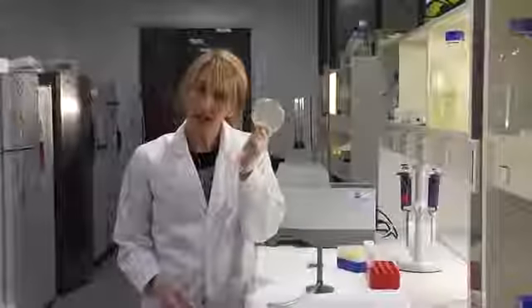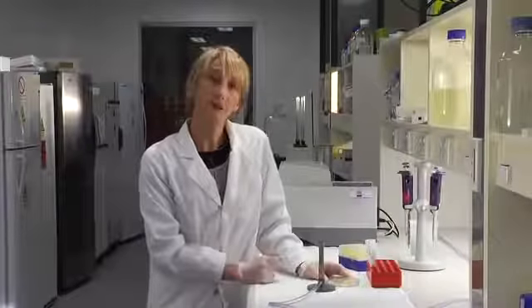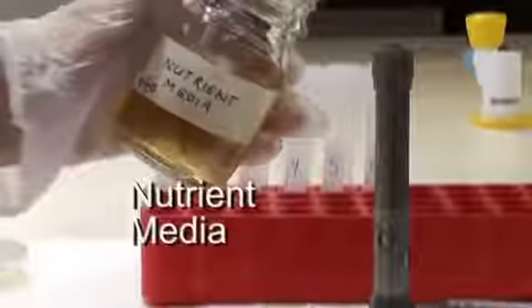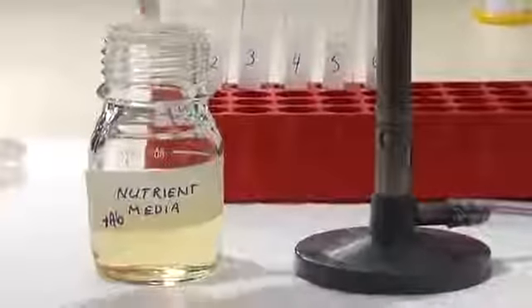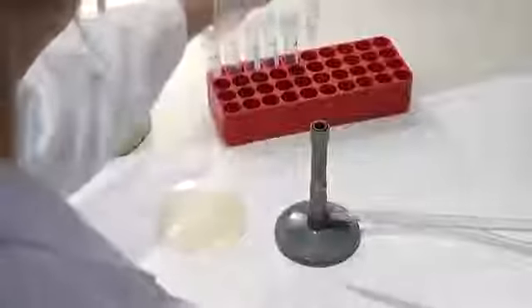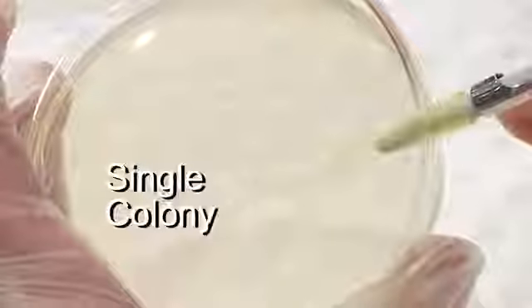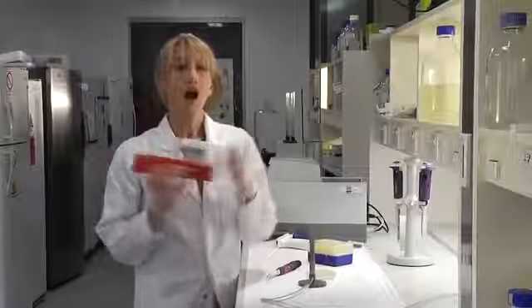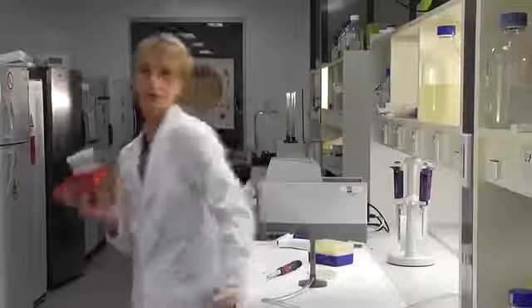So to check which of these colonies contain our plasmid with the insert, we're going to take each colony and grow it in culture overnight. So first, we need to set up some tubes of nutrient media with antibiotics. And then to each tube, I'm going to add a single colony. So, now each tube contains a single colony. I'll just take them to the incubator and let them grow overnight.